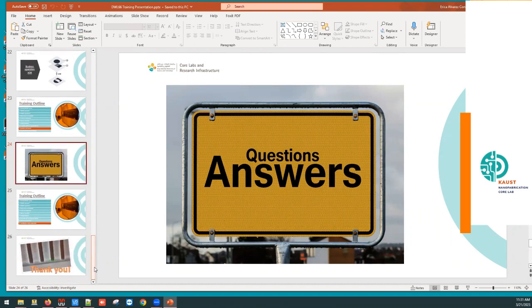Hi, Erika. Yes. Are you going to send us only this training PowerPoint and the SOP? Yes. Or could you please send us this recording as well? Is this possible? Yeah, this is what I mentioned in the beginning. I will send you the recording, I will send you the slides, and I will send you the SOP.